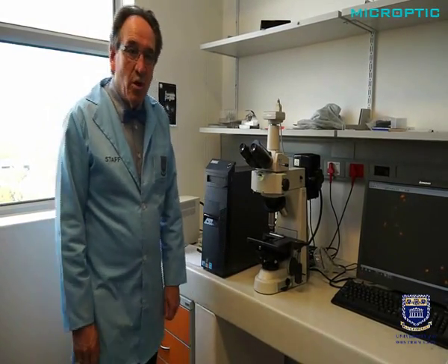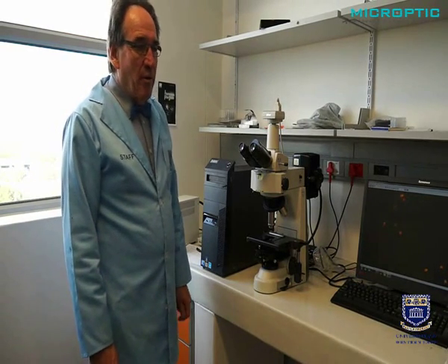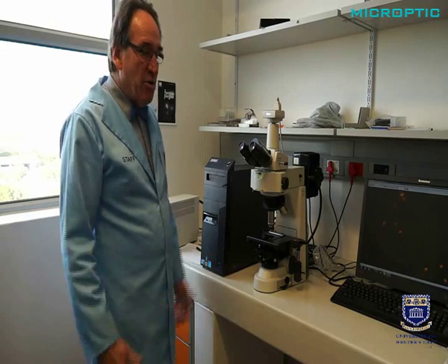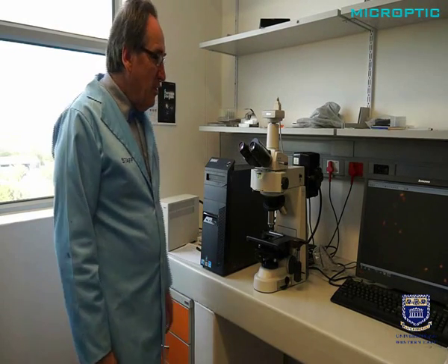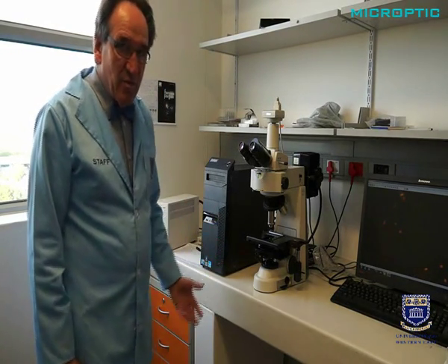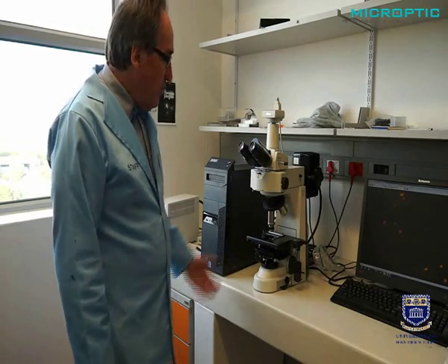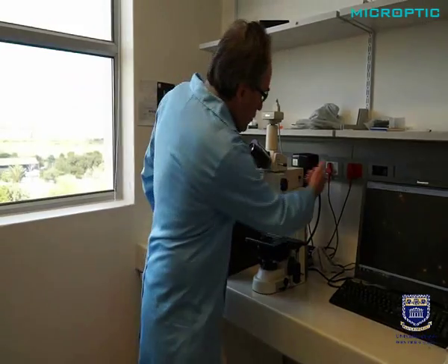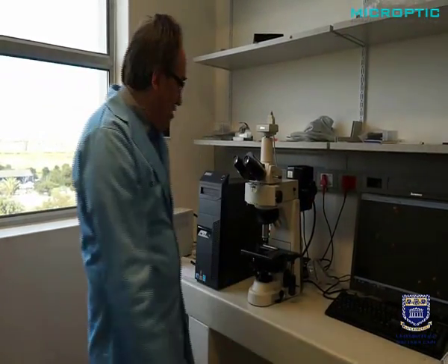It is not the intention of this to show you all the modules of the Sperm Class Analyzer and CASA analysis, but rather to show you the typical setup in a lab. And here you can see if you want to do fluorescence, for example vitality staining, you need again a good microscope, but then with of course epifluorescence attachment.